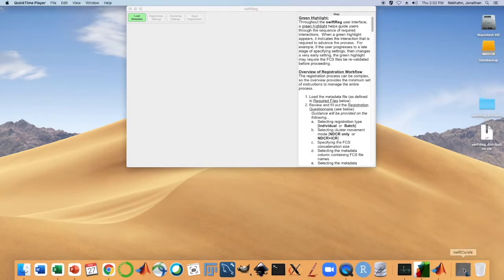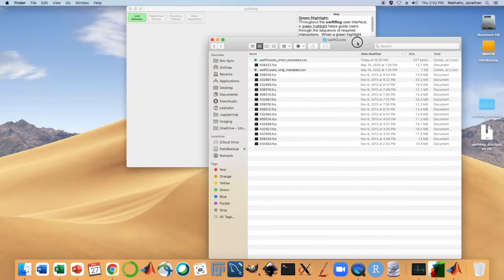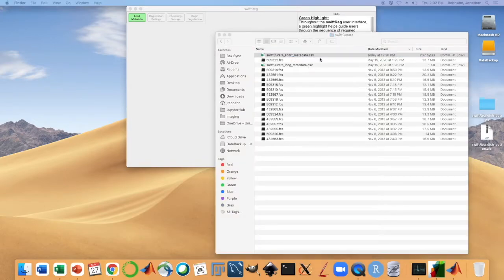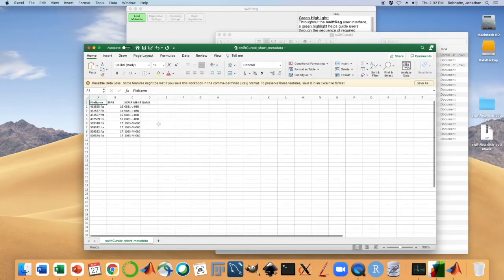Next, we'll look at some curation issues that you might run into with processing your data, either pre-processing it prior to registration or just in general. Sometimes samples have different channel names, for example. So we'll look at this experiment that has just 2 batches.